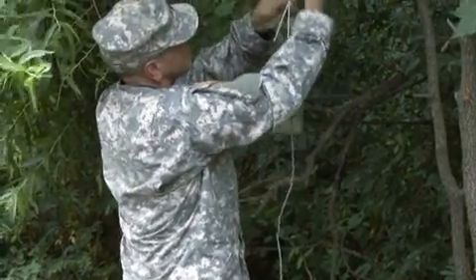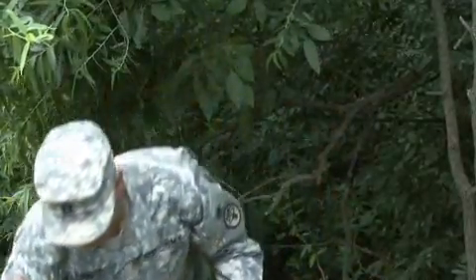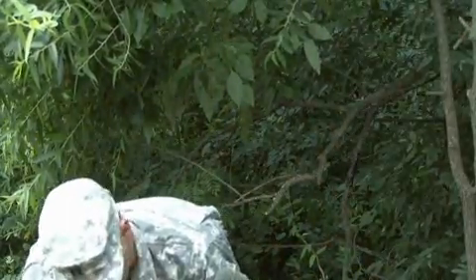For more information on handling the specimens, refer to the Handling, Packing and Shipping video produced by USAPHC.